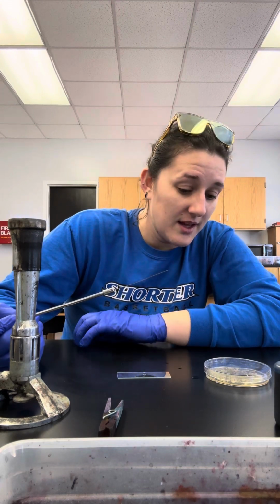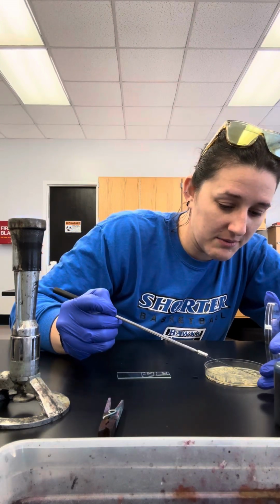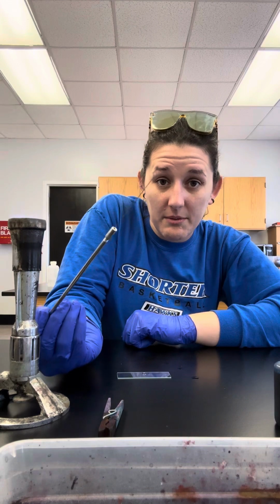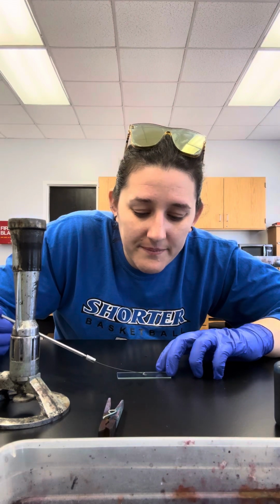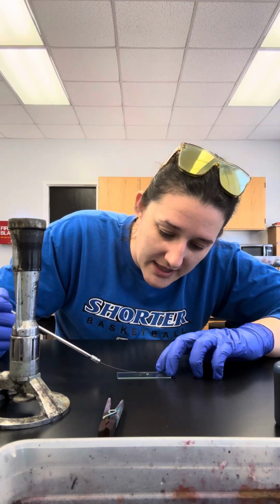Sorry guys, I sound awful. All right, so next, once this is done, we open up our dish. We go get a little bit of bacteria. We close the lid back because we don't want that open for longer than it has to be. So we take what we have on the end of the loop. I'm trying to help y'all see that. We put it in the water droplet and we spread it around on the slide.